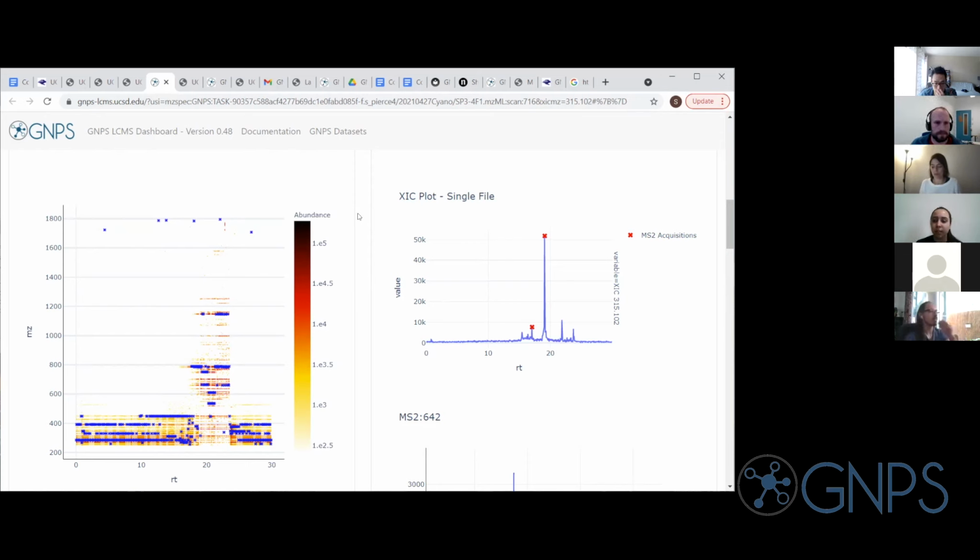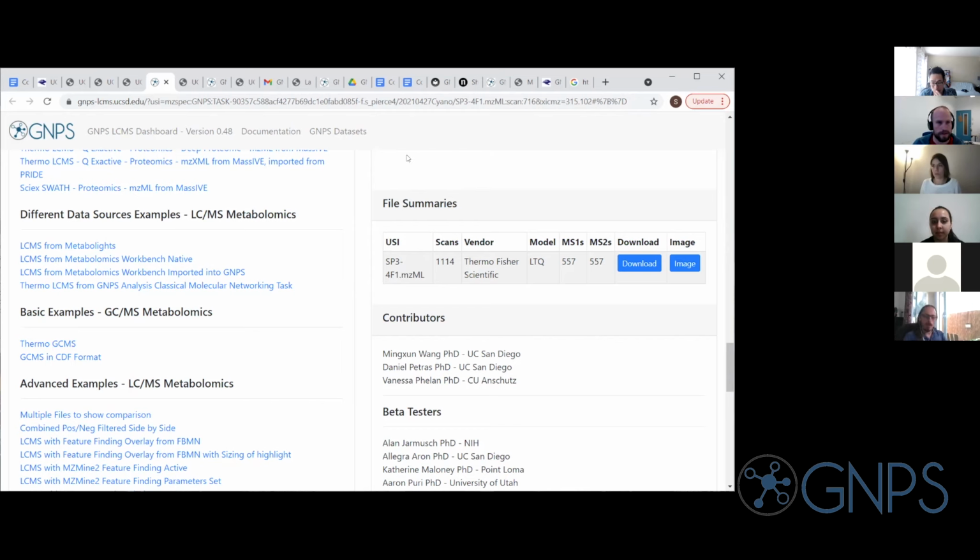All to the bottom. Oh yeah, so this is a LTQ Thermo. Yeah, I think that's definitely there in the data dependent acquisition settings. You may want to optimize that, but often it's just a couple of clicks in your method editor.